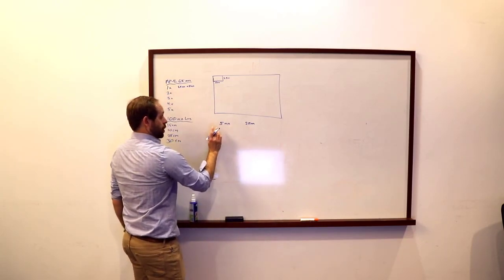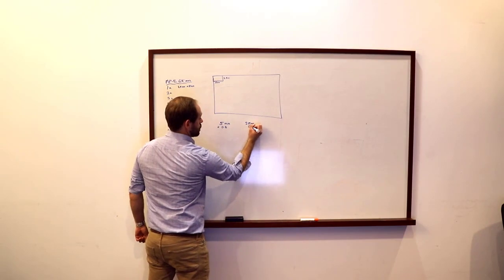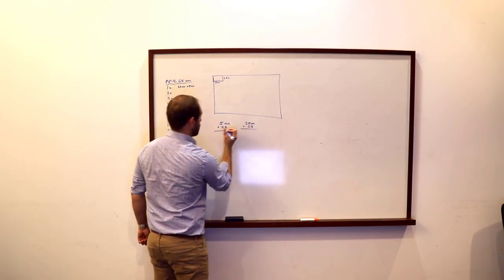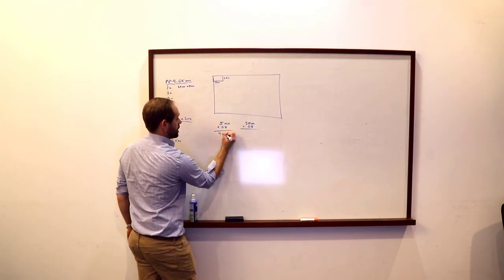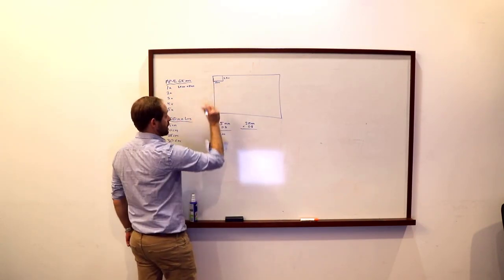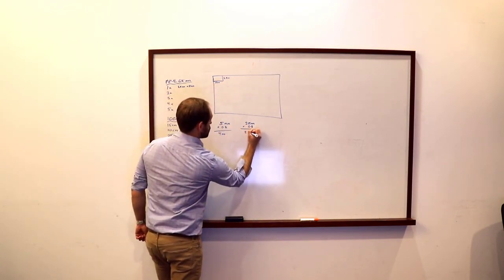and we're going to multiply them by 0.8, which is going to give us a 20% overlap value. So at 5, that leaves us with 4 millimeters. That means we are now going to be programming our controller so that this long axis moves 4, and this axis will move 2 millimeters.